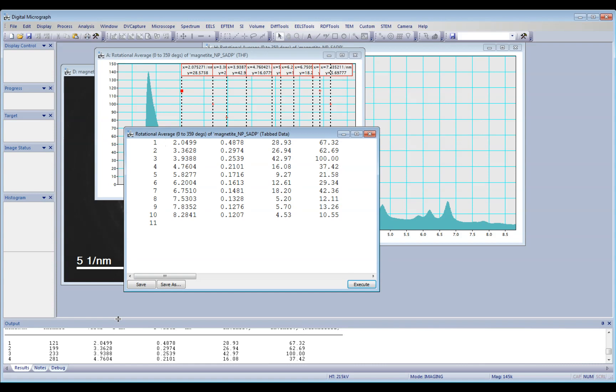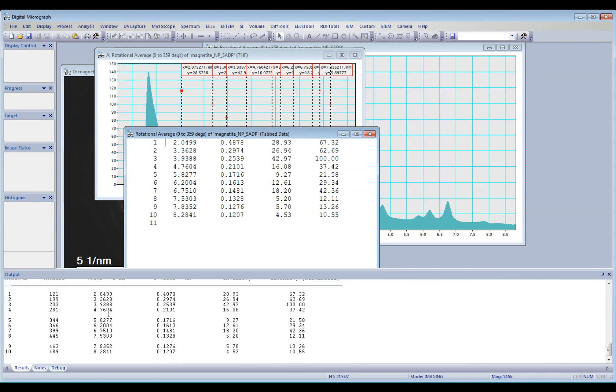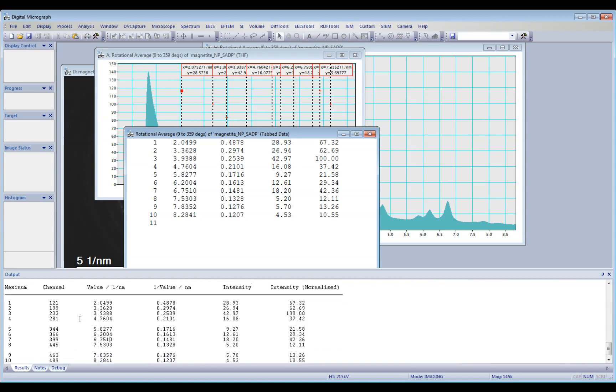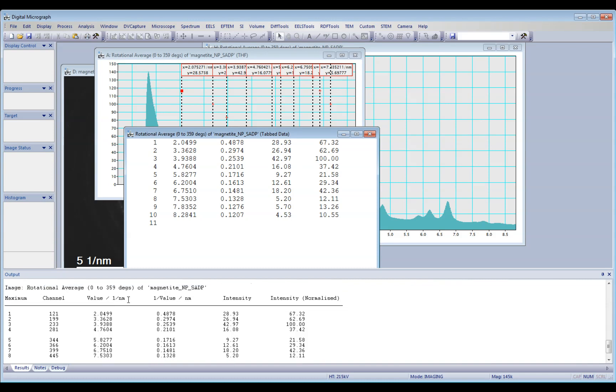Of course, the results are also reported here, down here on the output, so you can see the values 1 over nanometers in the reciprocal space, and also in the real space, nanometers.